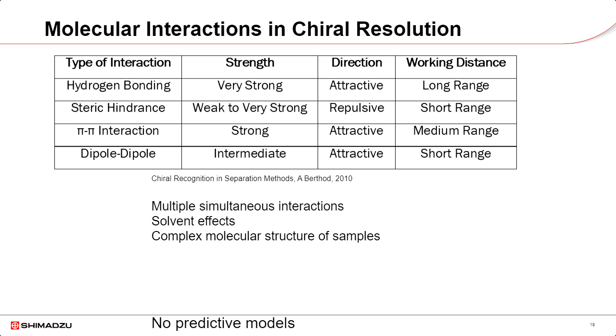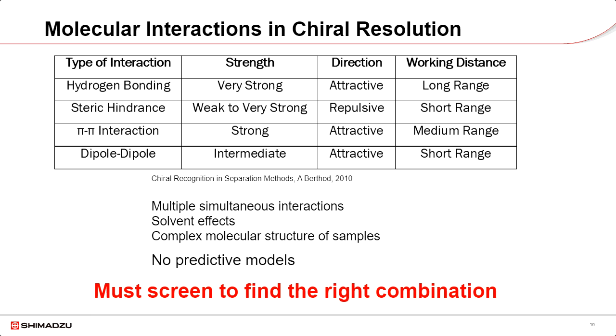And there's really no predictive model that can help you out. Again, it's not orthogonal to hydrophobicity like we saw in that graph earlier. It's all over the place. And what that really means is find the right solution for resolution. You have to do a lot of screening.